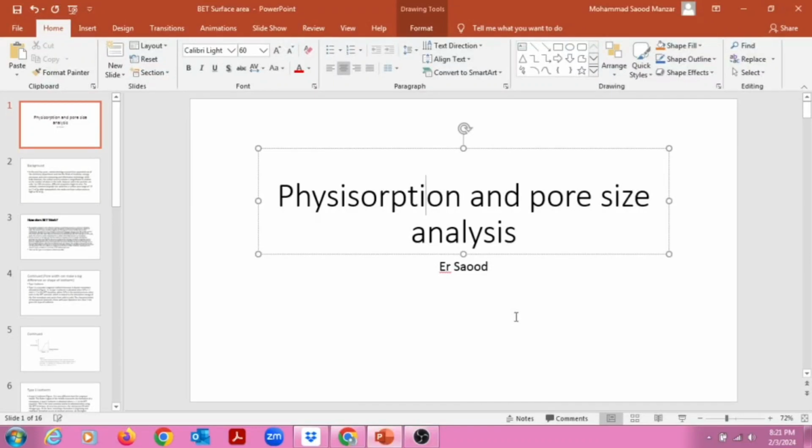Guys, in today's video we'll learn about the topic called BET surface area analysis. The word BET means Brunauer Emmett Teller surface area analysis. This is also called the multi-point measurement of an analyte's specific surface area through gas adsorption analysis, where an inert gas like nitrogen is continuously flowed over a solid sample, or you can say the solid sample is suspended in a defined gaseous volume.